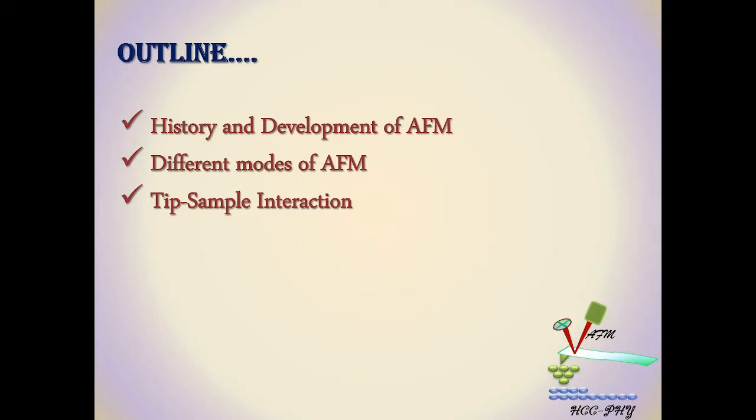So, the outline of the presentation is the history and development of the atomic force microscope, and we are going to discuss the different modes of atomic force microscopes and how the tip-sample interaction takes place. First, let us see history and development.